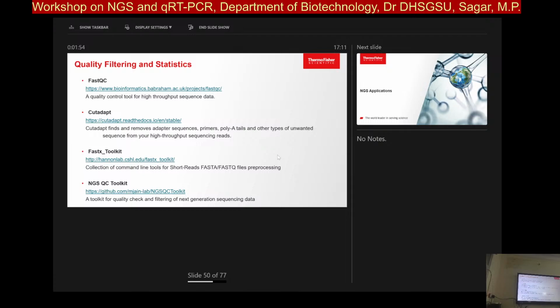You need to understand how do you do a QC for Sanger? Any idea? How do you do a QC for your PCR reaction? How do you do that? Try to blast, try to see if it's similar or not. It gives you confidence and then you try to screen more. Right? So something like that is also available for NGS, because NGS will give millions of reads coming at the same time. How could you screen that?